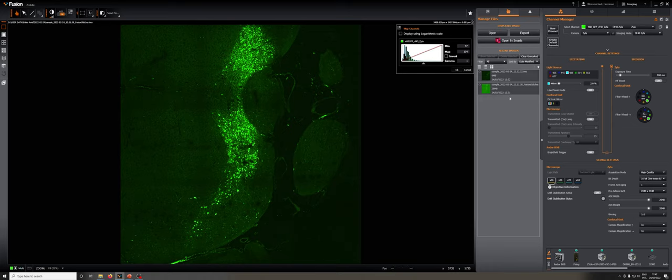Now we just have the things we did today, which we can filter using various criteria. You can mark some as favorites and show only the favorites, or show only the unmarked ones, or show all of them. You can also display them in a structural view showing the experiment had one time point, one z, one channel, and so on. If you double click on these, it will load that image — for example, a snapshot of a single region. This can be really useful for navigating the images we take.